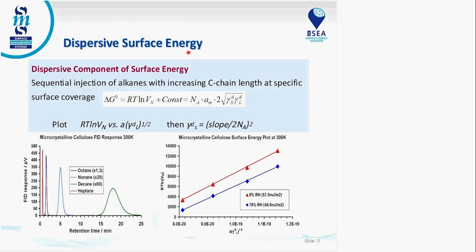So just stepping back a little bit to how we measure surface energy. As I mentioned, we use dispersive surface energy.